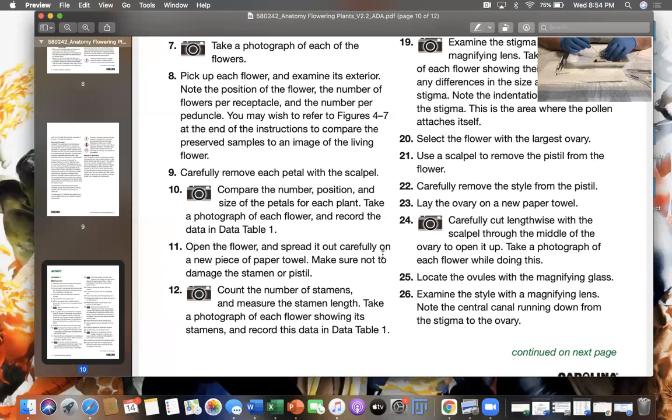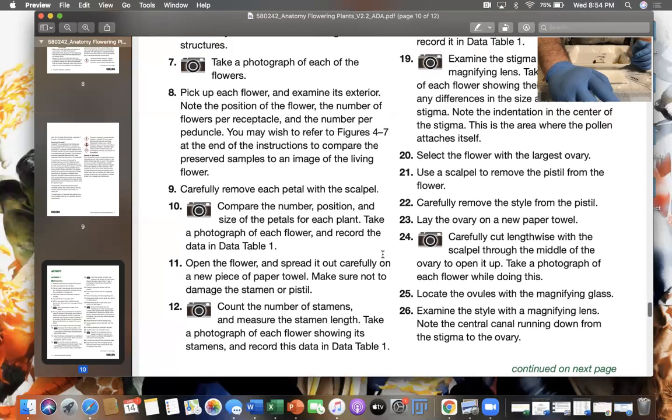On the honeysuckle, what's challenging is you have 1, 2, 3, 4, 5, 6. If they're just damaged, it's hard to tell. And then on the chrysanthemum, I don't even know if we could count that. I'm not going to try. You can just put a lot. That's perfectly fine.